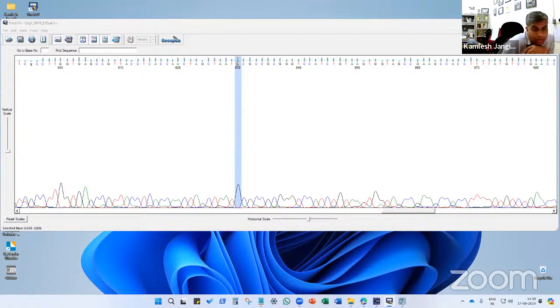Dr. Sivakumar Kannan asks: any software to automate the process and curation of DNA chromatograms? Yes, there are many softwares. In fact, the software that we are going to use next can also do this manual job automatically. But we don't really use that often, especially when we are handling single sequences and the sequences are very crucial for our data set.